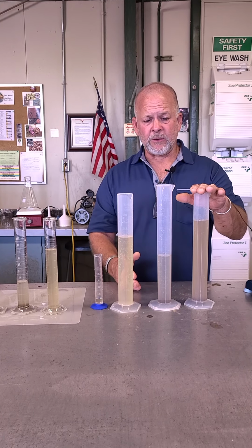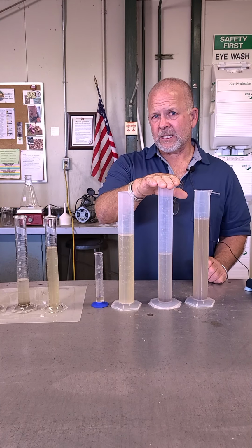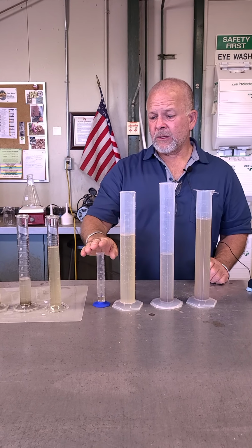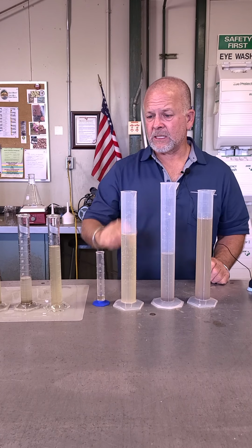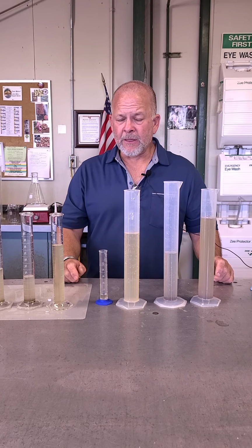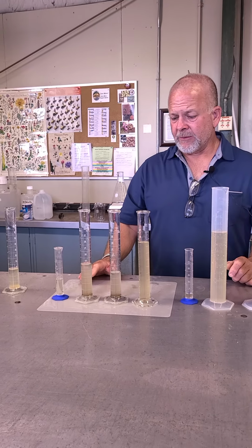So here we go, treatment 1, which was the DI water, treatment 2, which was a saline soil, treatment 3, which was a sodic soil, and then treatment 4, just in this little tiny one, because you wouldn't have been able to see it in this larger graduated cylinder, the saline sodic.